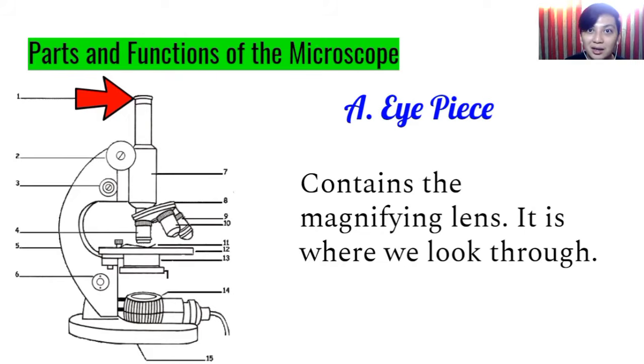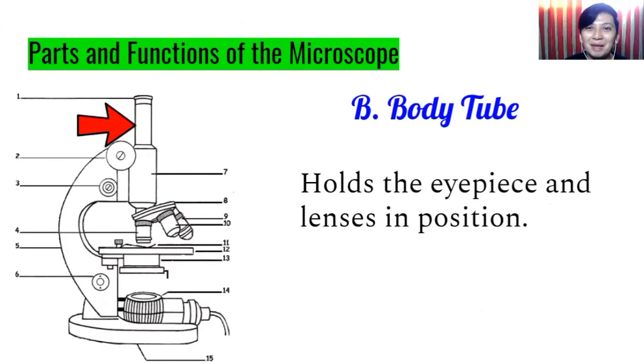eyes are open. Okay? So, dapat ang parehas mong mata nakabukas. Kahit yung isa nakatakip nakabukas na, huwag kang pipikit na ganyan kasi lumalabo. Diba? Try nyo.